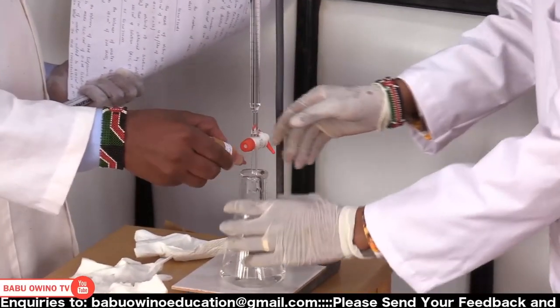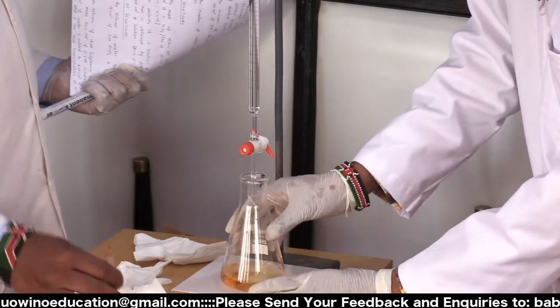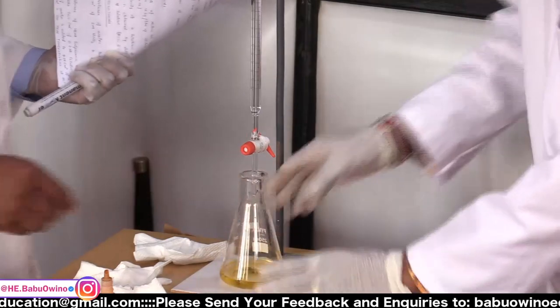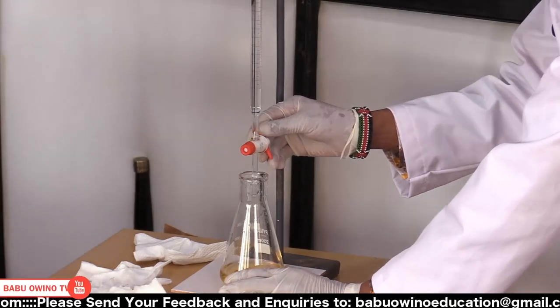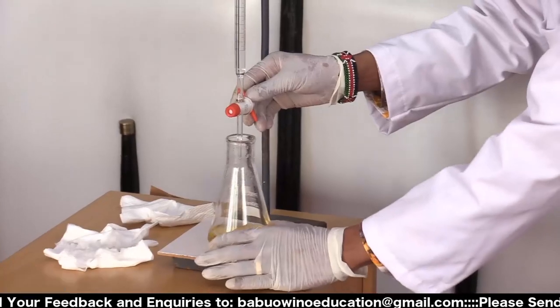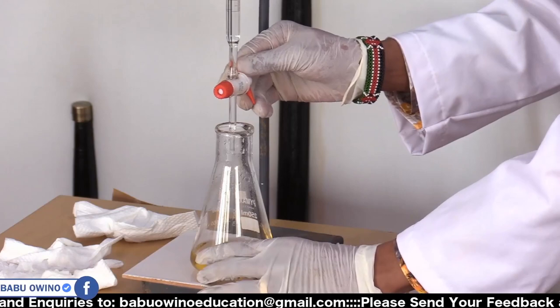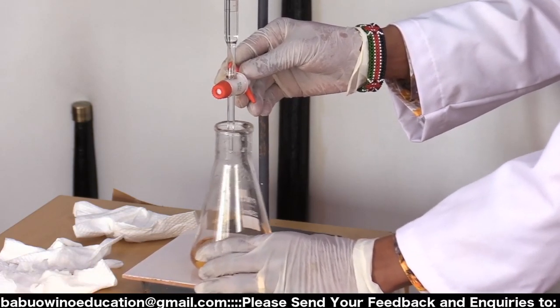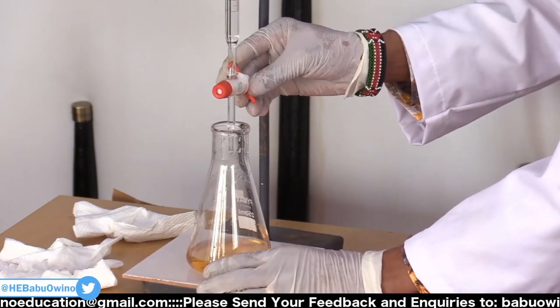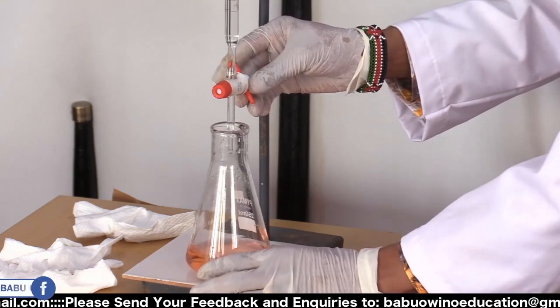Oh. Two drops of the indicator. Okay, then release. Those mistakes are common, where you forget the indicator. In case you forget, how do you remember? When you see there are no changes, that your solution is again colorless, note that there is a mistake you've done. So you don't continue. But again, don't panic. If that happens, then you continue.